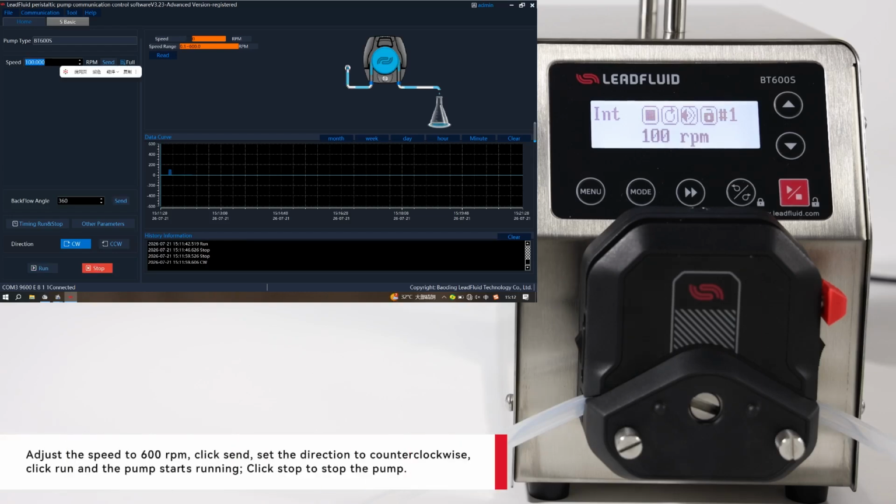Adjust the speed to 600 revolutions per minute. Click Send. Set the direction to counterclockwise. Click Run, and the pump starts running. Click Stop to stop the pump.